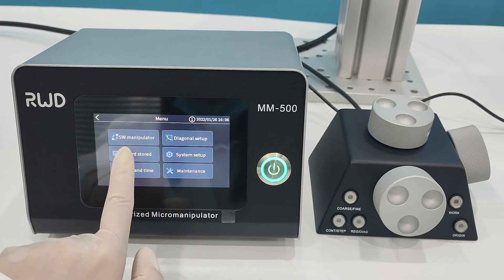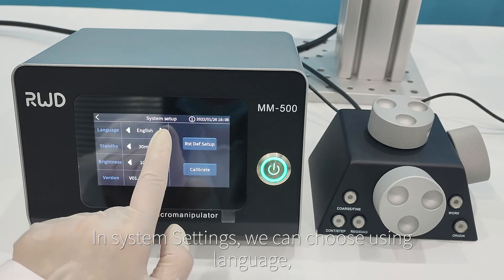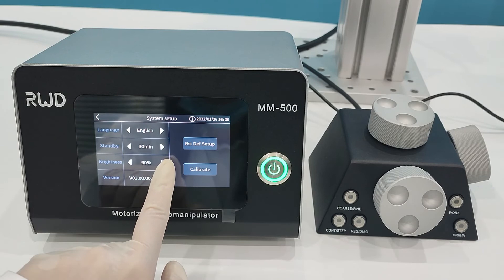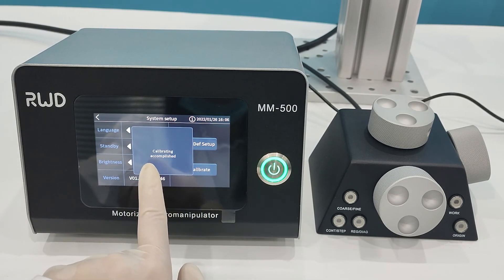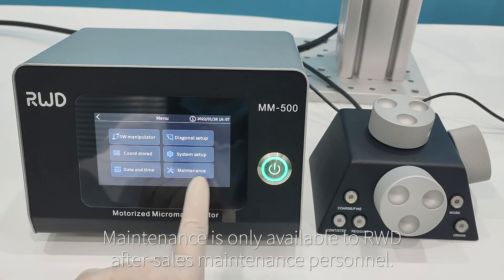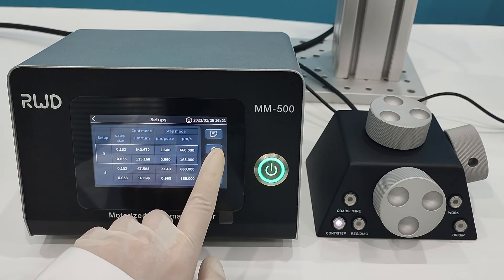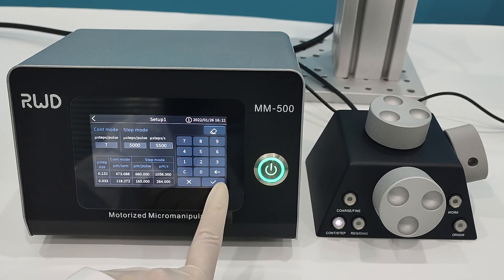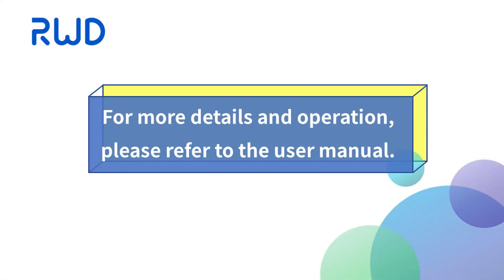We can check memory points such as the relative origin, work point, and origin. In system settings, we can choose language, automatic standby time, and screen brightness. After switching or moving the manipulator, zero calibration is required to ensure accurate position. There are also date and time settings. Maintenance is only available to after-sales maintenance personnel. In the preset program section, 10 default programs are provided, which can be modified and saved from the parameter editor and executed using the call button. For more details, please refer to the user manual.